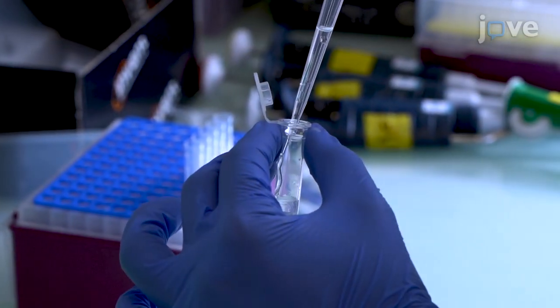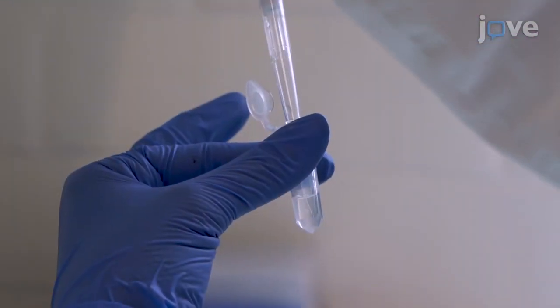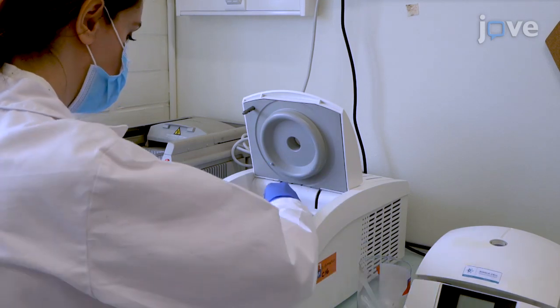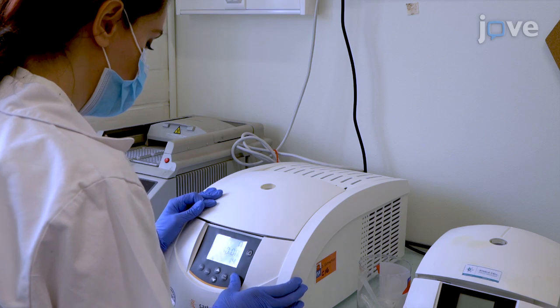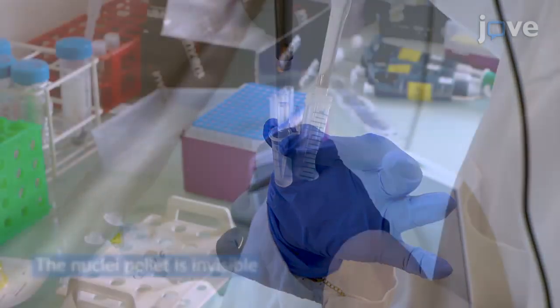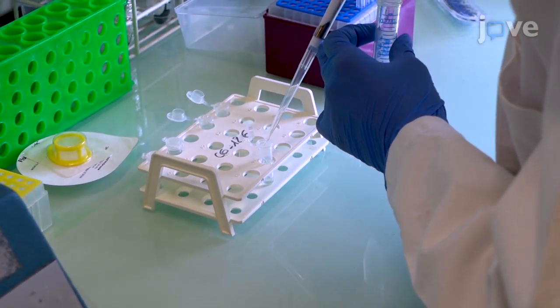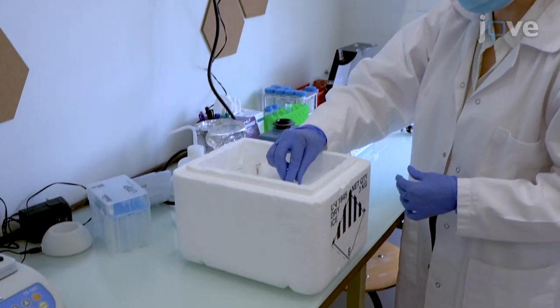Re-suspend the pellet in 0.8 milliliters of cold buffer B by pipetting 2 to 3 times. Centrifuge the nuclei at 600 times G for 10 minutes, which will separate them from membrane debris. Carefully discard the supernatant, then re-suspend the isolated nuclei in 500 microliters of PBS with 5% BSA. Keep the suspension on ice until FACS.